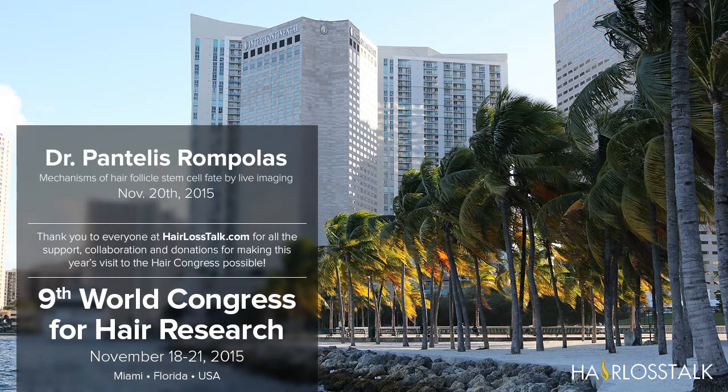We can see that there are particular areas where cells assume certain activities. There's cell proliferation here. We can see cells dividing in a certain orientation, and also cells migrating to fuel the growth of the elongating follicle. And so the first question we asked is, can we use this approach to understand the behavior of stem cells during hair regeneration? How is the hair growth organized, and which cells are contributing to the regeneration process?